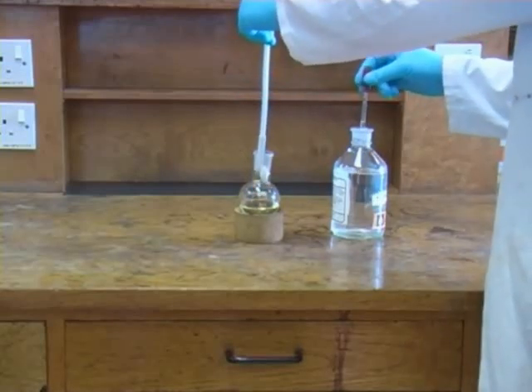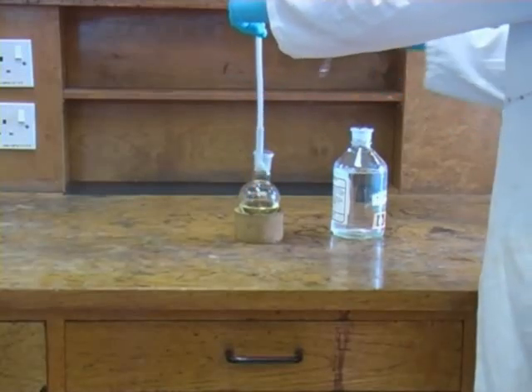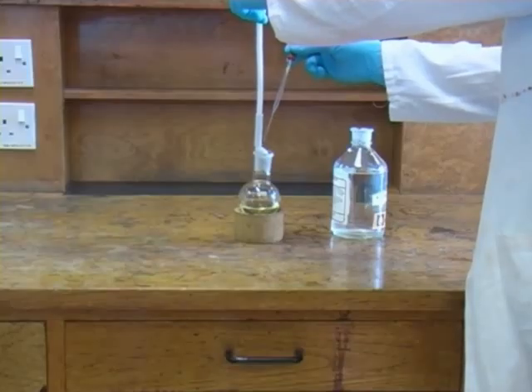The first step is to remove the magnetic stirring flea from the reaction flask and we need to wash this with ether to ensure that we don't lose any of our product.